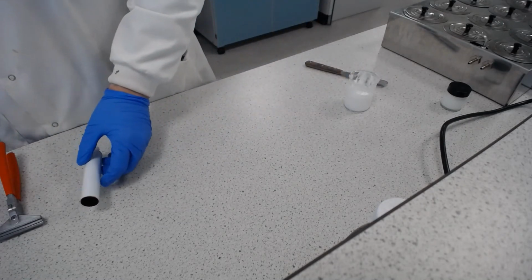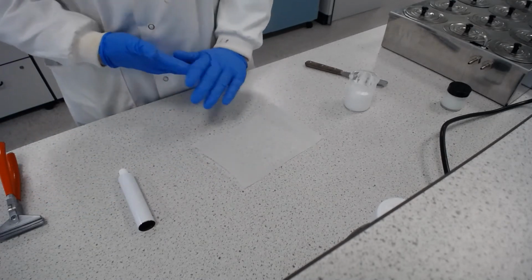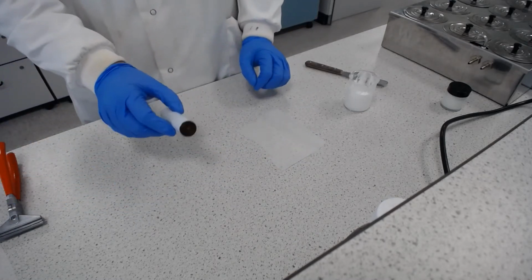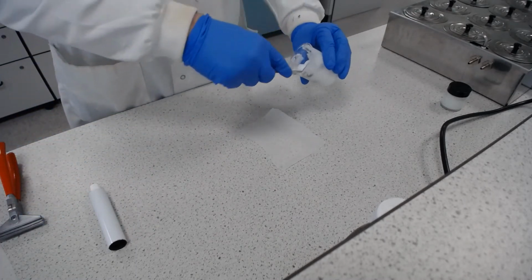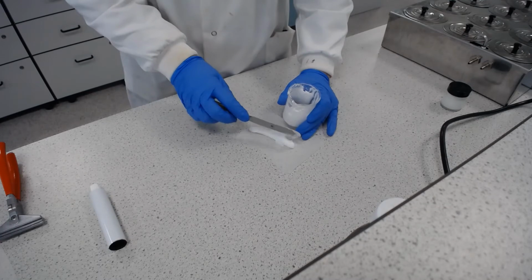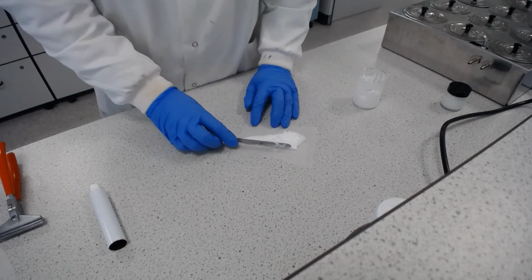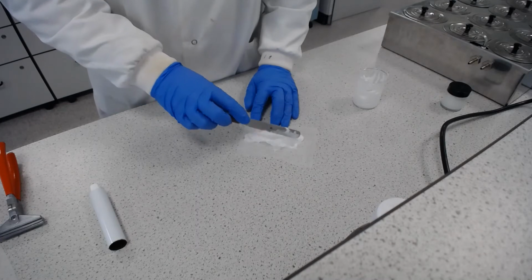So one good way of getting it in is to use some greaseproof paper, then make a row of our cream, roll the greaseproof paper up, then insert the greaseproof paper into here, and then squeeze it out into the tube. And that's what I'm going to do now. And again, you would then have to make sure you've got the right amount in here. So you might need to then just top it up with a little bit more using the palette knife after you finish doing this. So let's get a nice, roughly even slug of that in there.